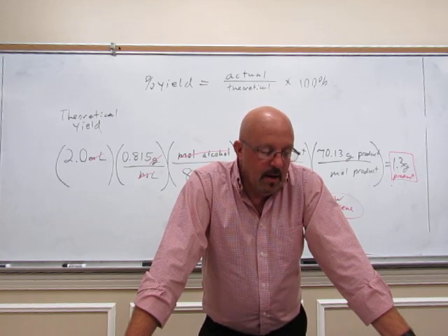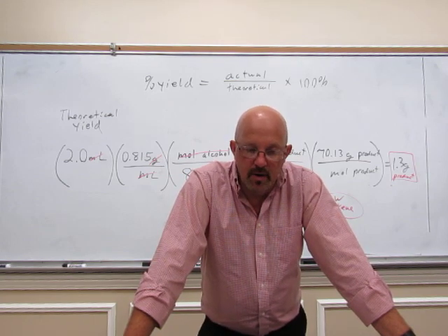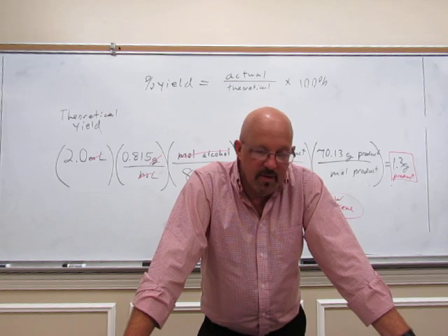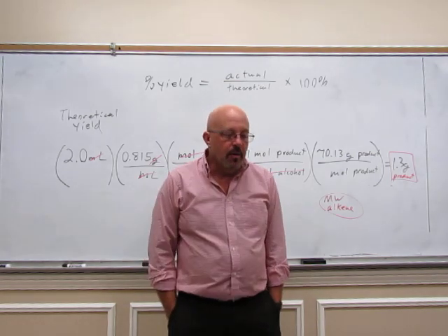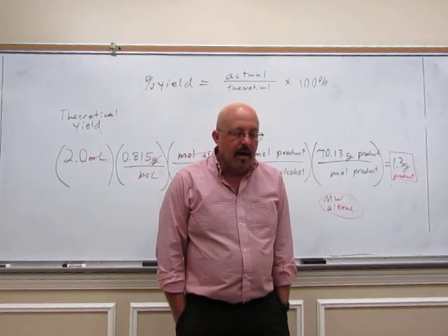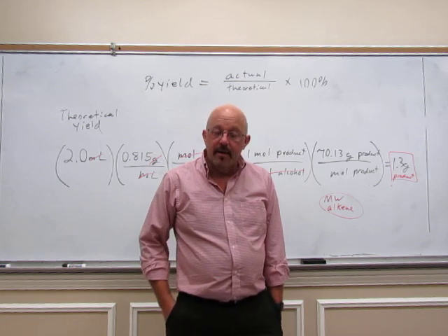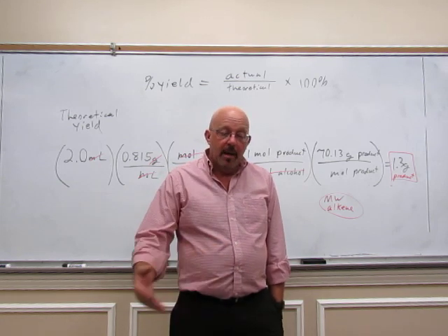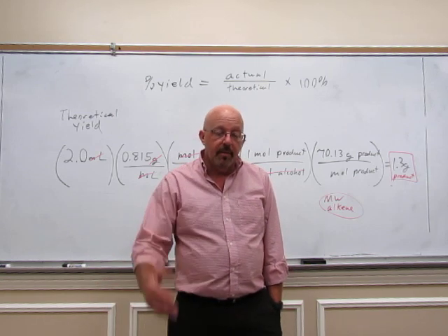So you can say, the OH stretch at 3369. Give me the position. Don't just say OH stretch. I don't know which peak you're talking about. Say the OH stretch at 3369 reciprocal centimeters. Don't forget the units. Disappeared. Hopefully it did. We'll be able to see in your spectra, in your product, if it did all disappear.